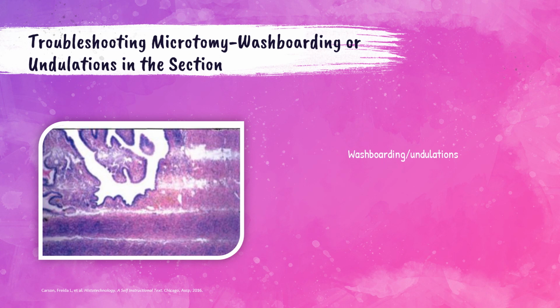This is an example of washboarding, also called undulations in a tissue section. So you see these, see how it looks kind of crinkled or wrinkled, sort of like an accordion type of wrinkling. So that's what undulations are.